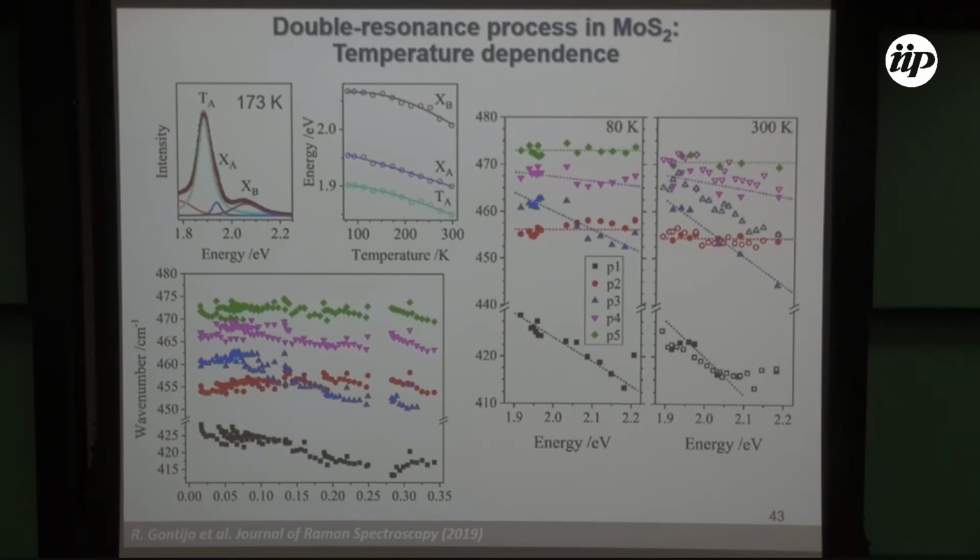So basically, we're asking: is it possible to correlate just by measuring the PL spectrum and Raman for some excitation energy, and try to see where my phonon is?